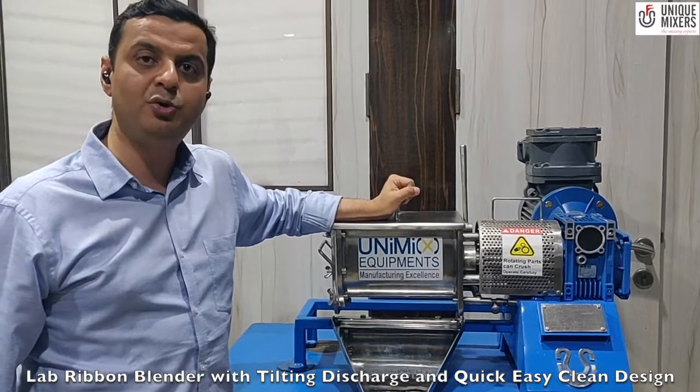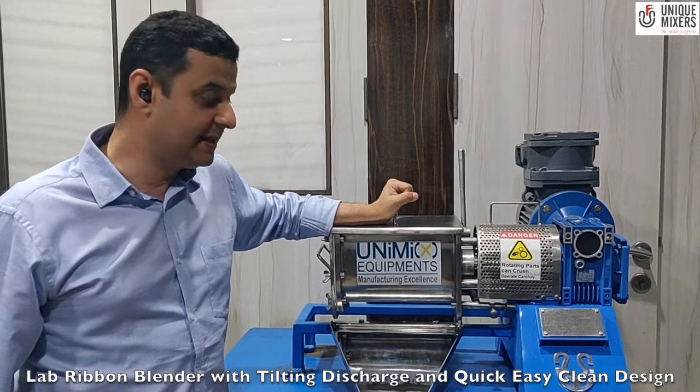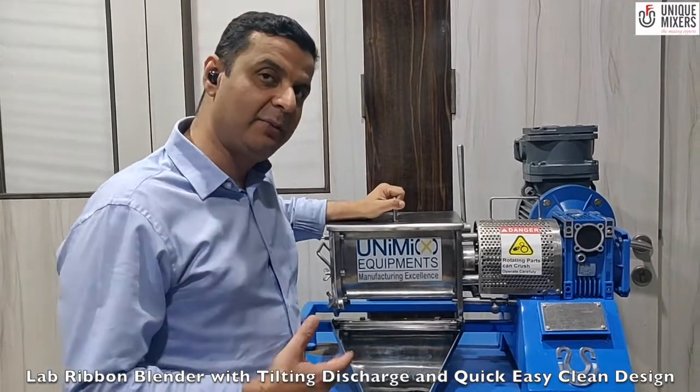The blender can be used for mixing of dry powders and slurries. The unique design here is this is a mixer with a tilting discharge.